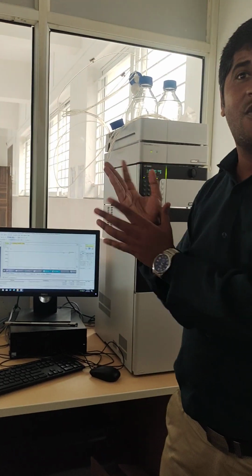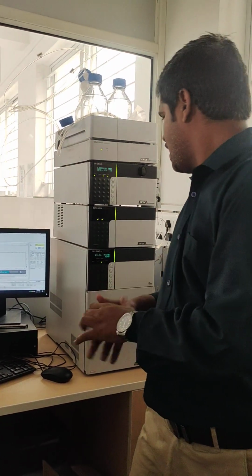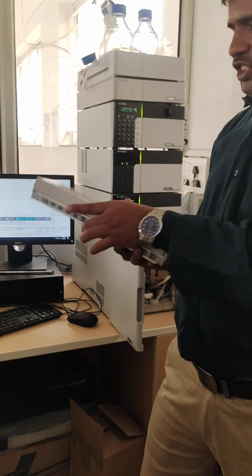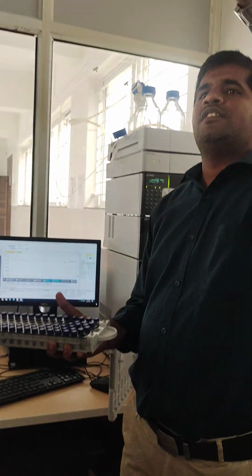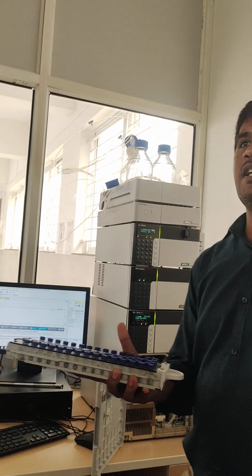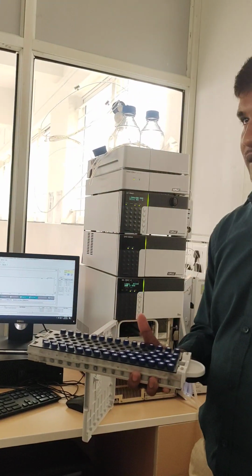That is called normal flow, isn't it? It is called normal flow. That is required for our actual analysis. Now in the sample compartment, in the first section I have added routine 30 minutes. What is that? Routine 30 minutes. One research fellow was there in the AMCP college.